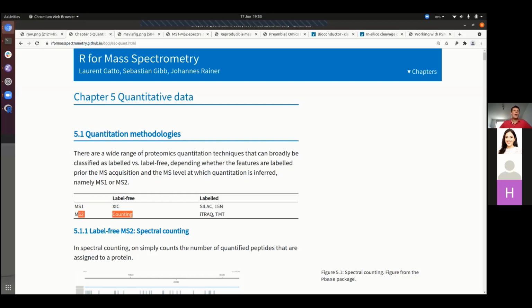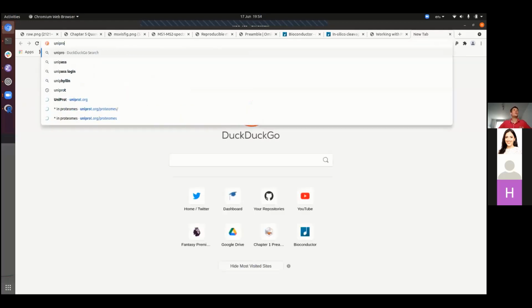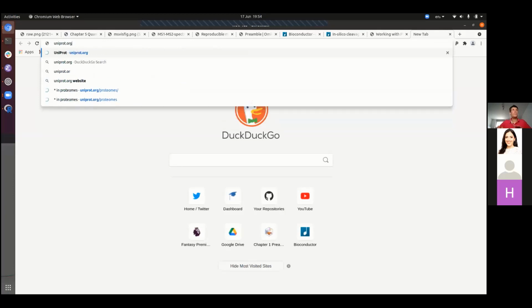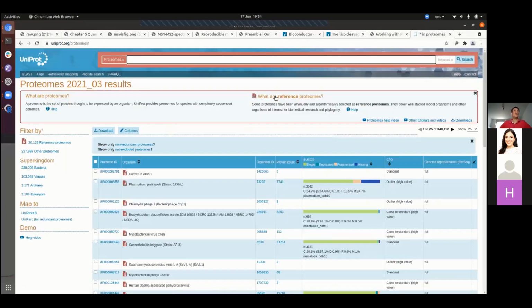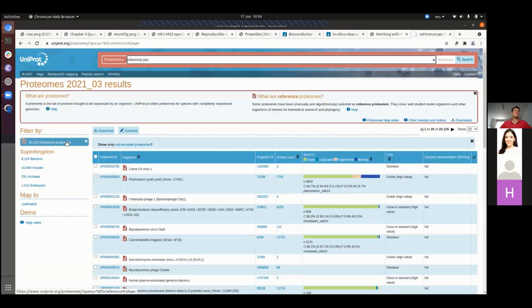Okay, so if I get you rightly, it means that it doesn't just work for proteins I'm familiar with, but other proteins I do not know of. Absolutely. So let me show you here. You would go on uniprot.org. So proteomes here. So here we have some reference proteomes. And of course, I always forget exactly how to do it. Maybe downloads. Anyway, you can download.